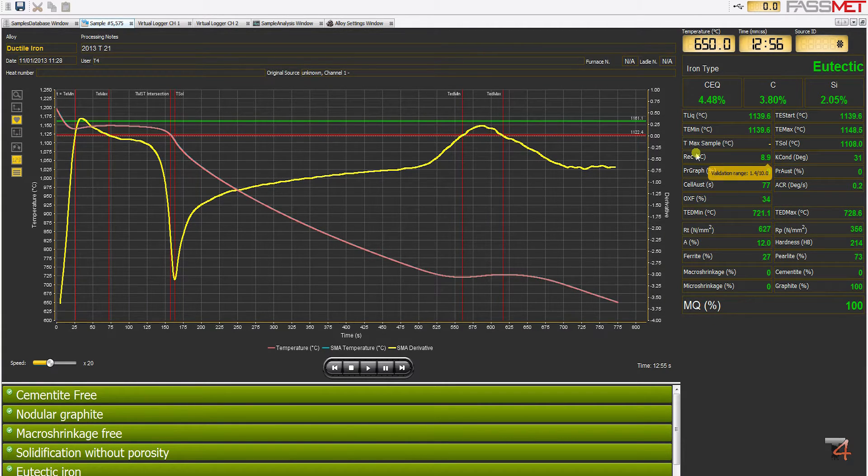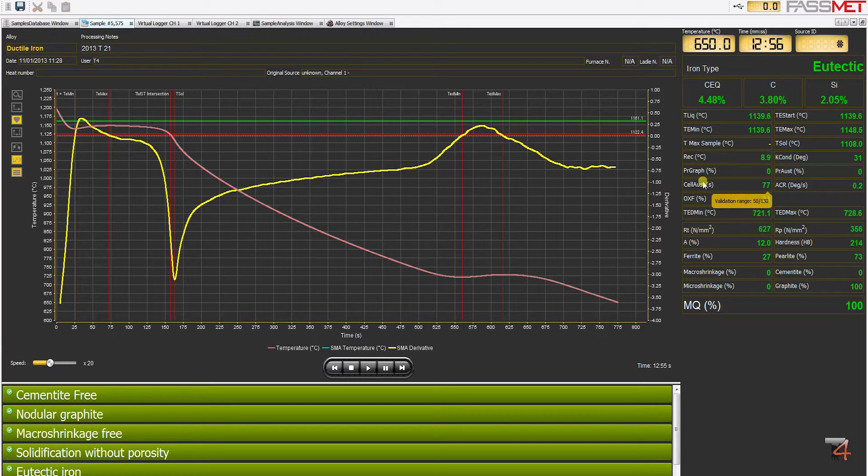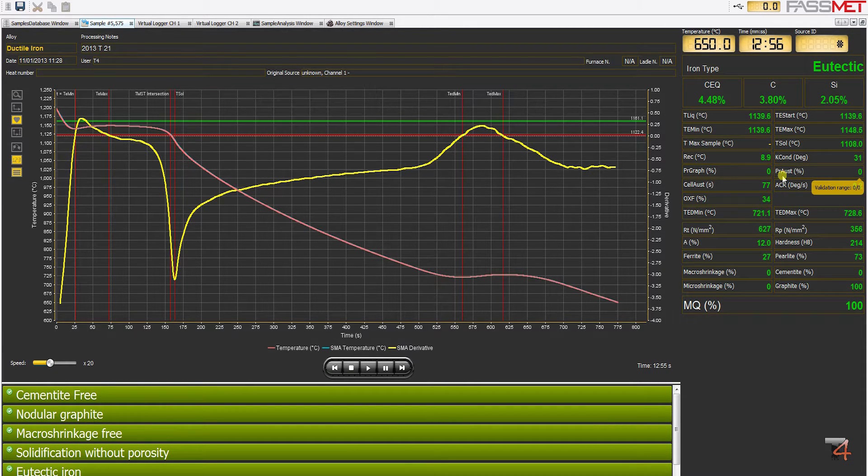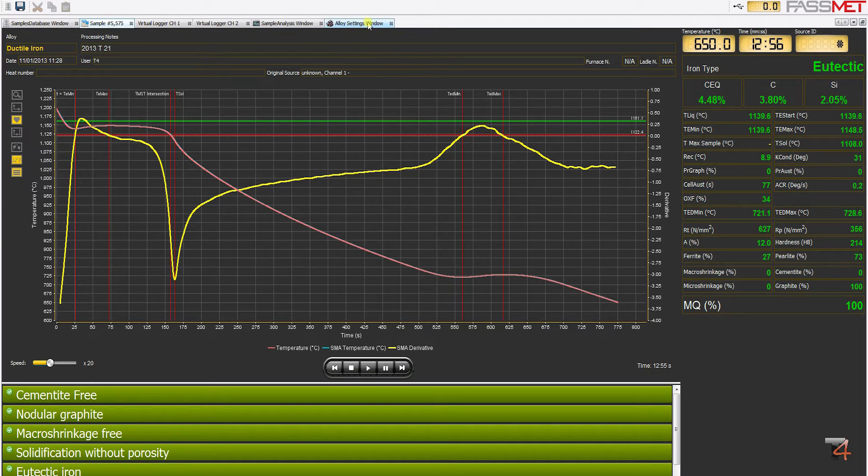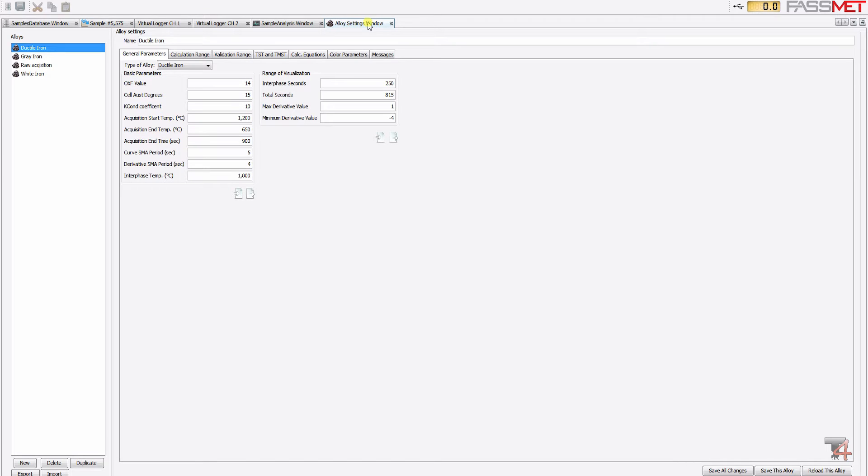recalescence, primary graphite precipitation and primary austenite precipitation can be easily configured from the alloy setting menu by the metallurgical engineer and can be changed at any time.